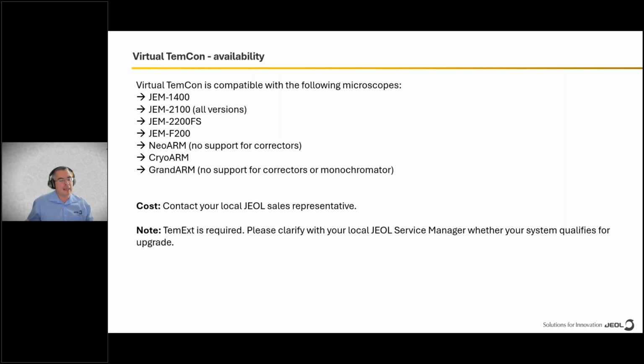So if you don't have physical panels at home with a way to forward the connection to the microscope, Virtual TemCon may replace quite a lot of the functionality. And if you open TeamViewer and use Virtual TemCon with something like an iPad or an Android tablet, you can also use the touch functionality to control the beam position.